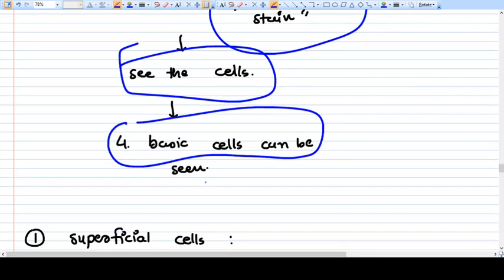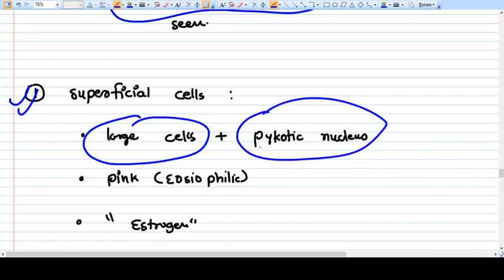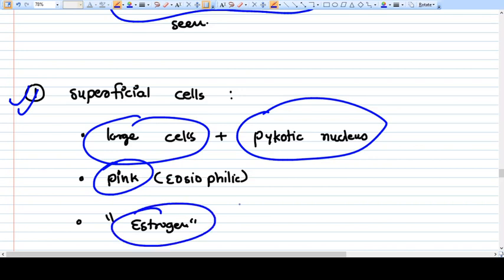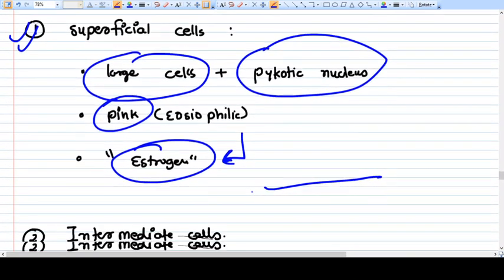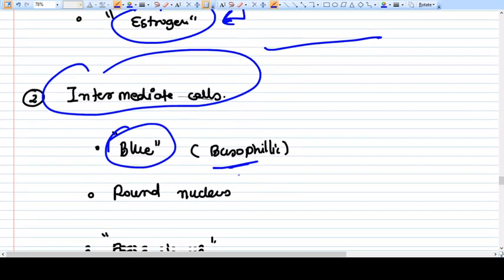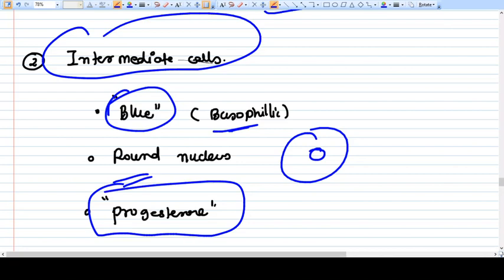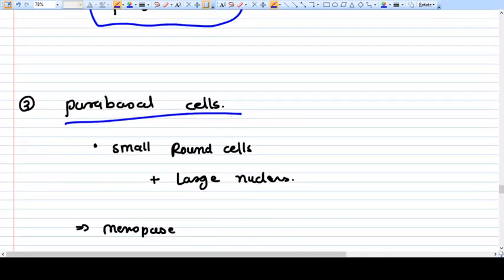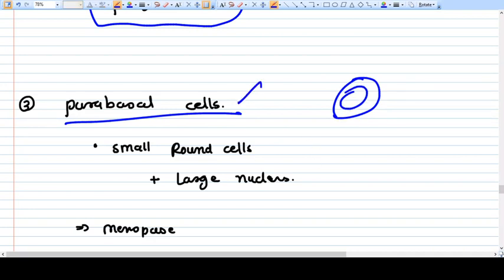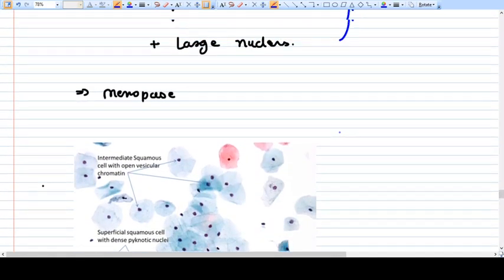There are four basic cell types seen on a Pap smear. First: superficial cells — large cells with small pyknotic nucleus, stain pink, and are dependent on estrogen, so they predominate when estrogen is the predominant hormone. Second: intermediate cells — basophilic (blue) appearance with a round, non-pyknotic nucleus, predominating when progesterone is the dominant hormone. Third: parabasal cells — very round cells with large nucleus, predominating at menopause when there is no estrogen or progesterone.